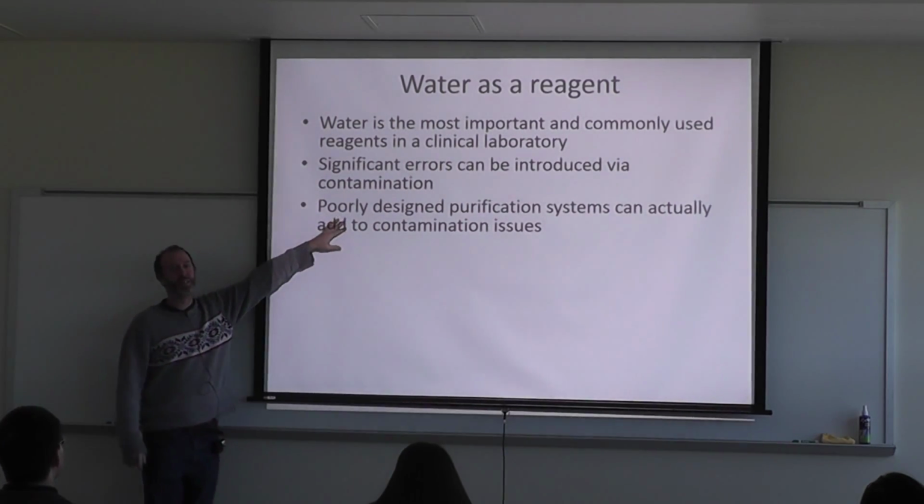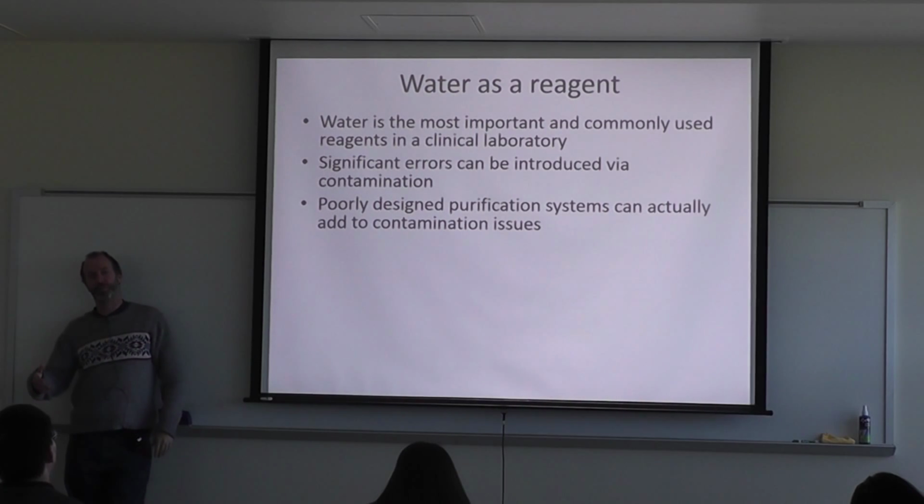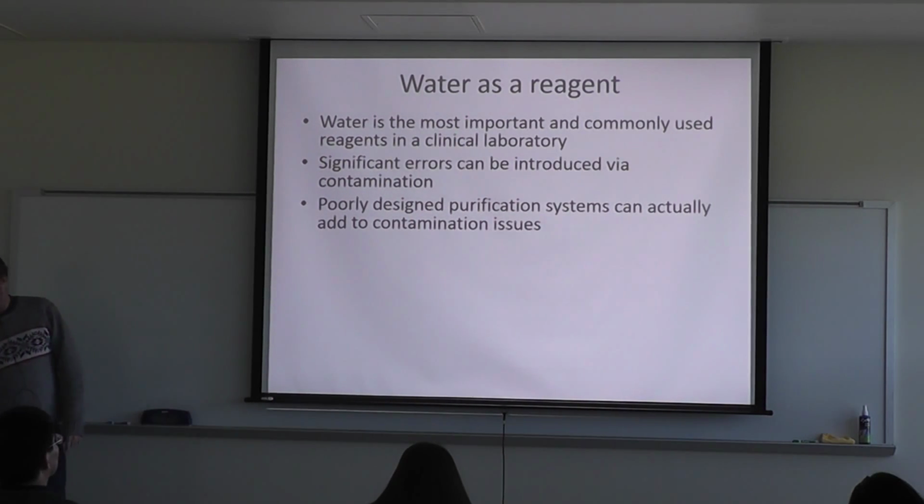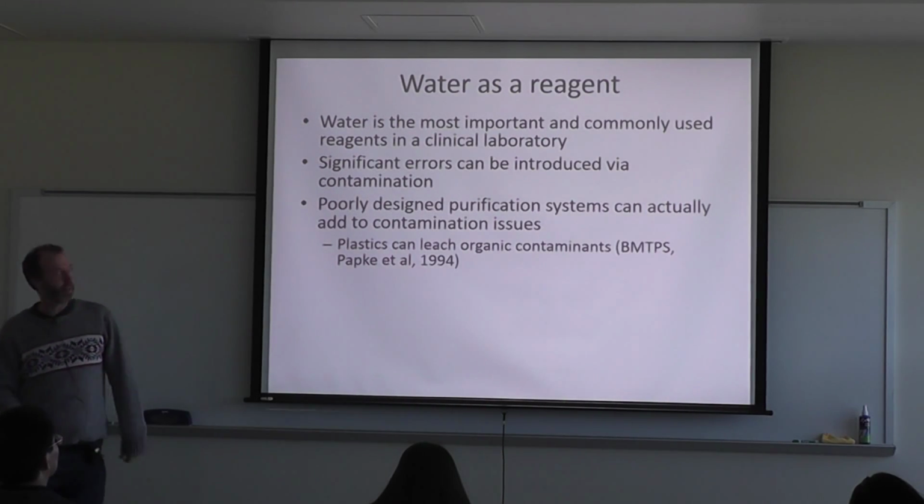purification systems have to be designed specifically for the facility that it's operating in. Do you know why? Where's the water come from for it? The feed water is going to be different in different locales, right? But here are some examples of contaminations.